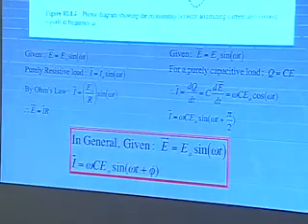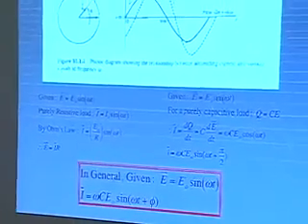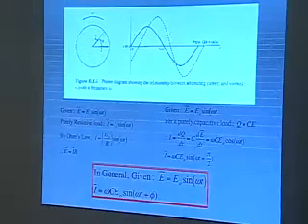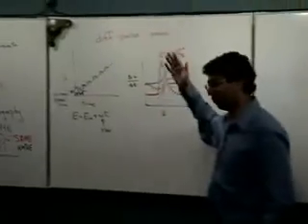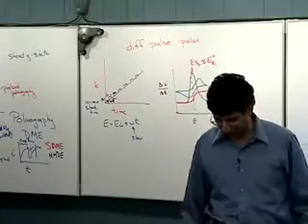So from a purely analytical point of view, if I can't get a signal out and I'd like to get one, there are some advantages to doing AC voltammetry. But again, you're more or less limiting yourself to finding a redox potential. You're going to get something with a peak, hopefully, and a redox potential. You're not going to get any mechanistic information.